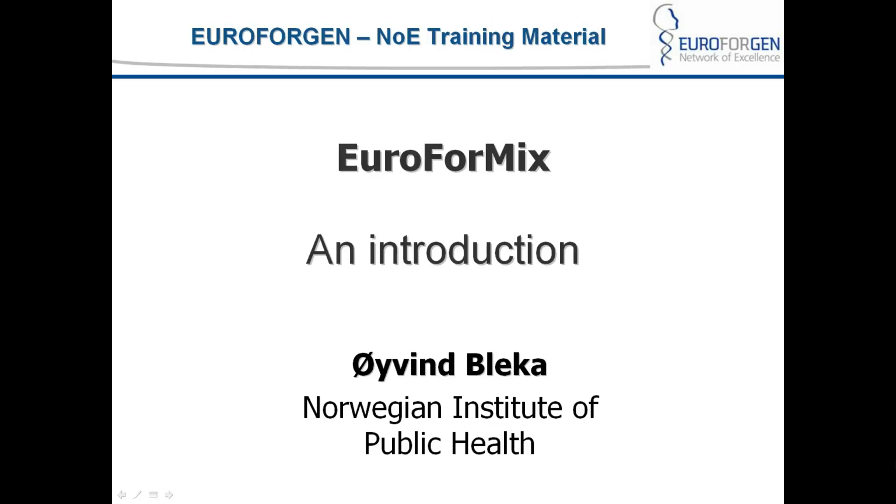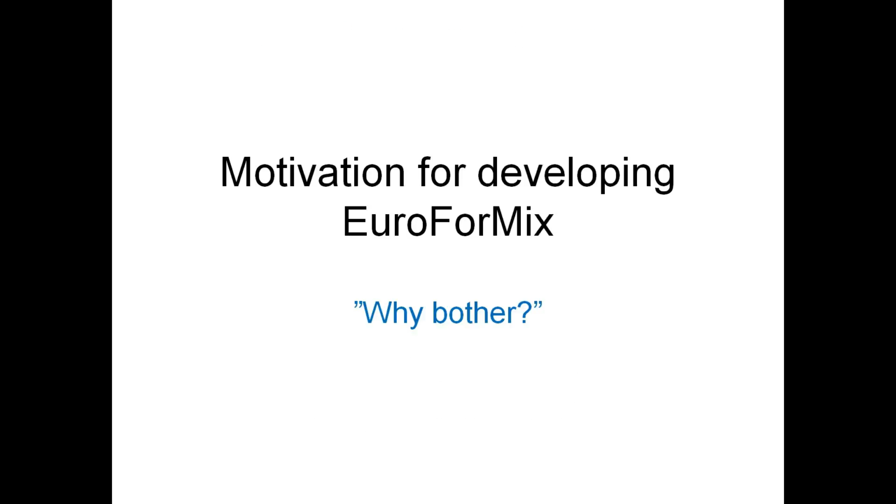So in this session I will give an introduction to EuroForMix. I will talk about why we developed EuroForMix, what it is, and what it is able to do. So I will now talk about the motivation for developing EuroForMix.